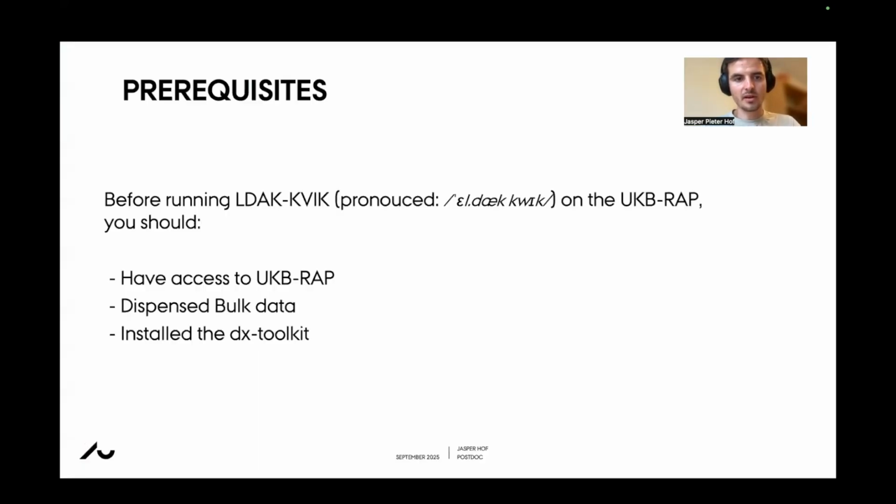These are some of the prerequisites before running LDAK-KVIK. We require firstly that you have access to these data, that you have also dispensed the bulk data, which contains the genotype data, for example. And then finally, you should have installed the DX toolkit on your computer, because this is what we'll use to set up a connection to the UK Biobank Research Analysis platform.